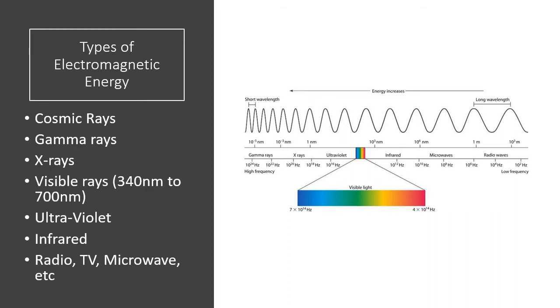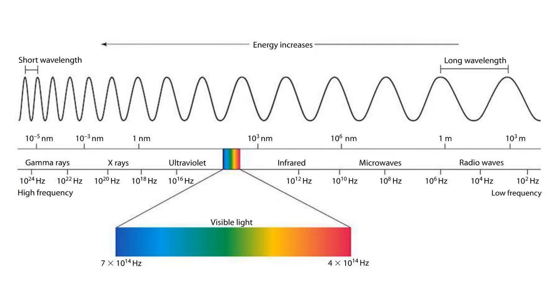Next are types of electromagnetic energy. Now, we're not going to discuss this anymore kasi these are very physics. So, analytical chemistry tayo. But anyways, what we're concerned about is the visible ray region, ultraviolet, and infrared. Because spectrophotometry can revolve around these ranges. So, radio, TV, and microwave, hindi na siya kasama because we don't usually use it for measurement. Okay, so again, another visualization of the spectrum.